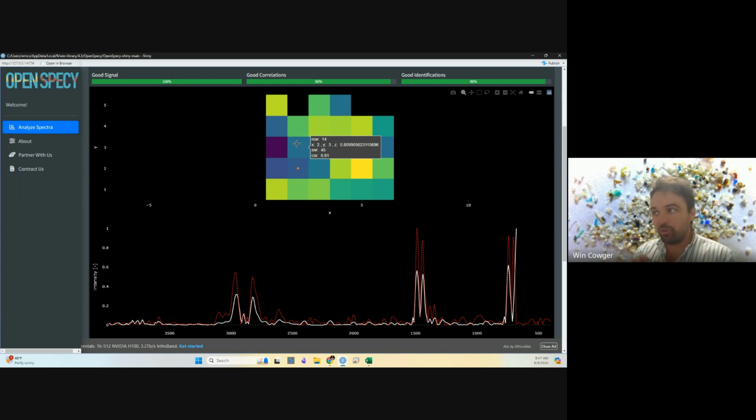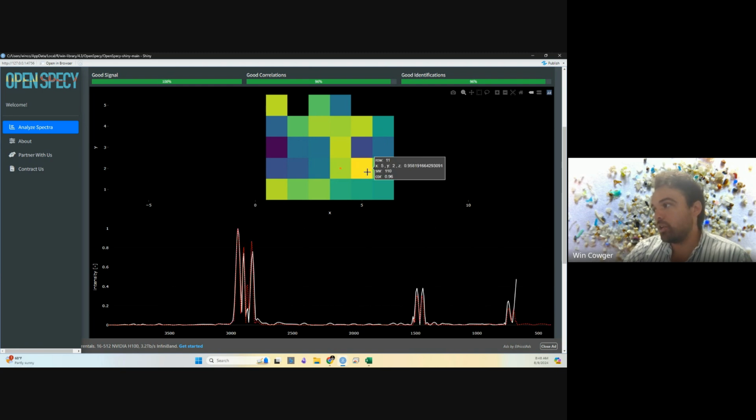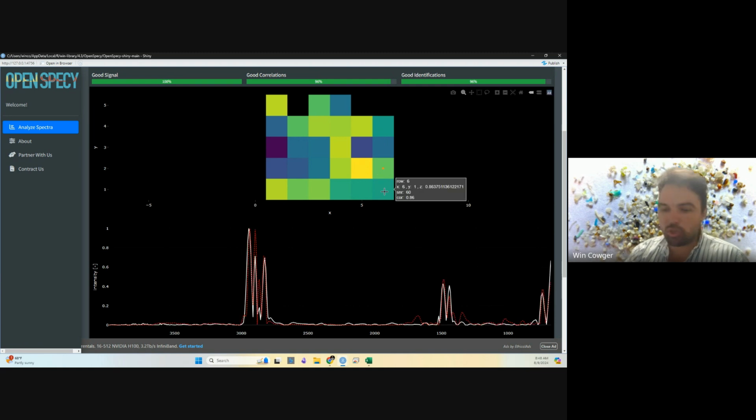You do need to have that level of intuition and not just trust that this is working 100% for you. Because if you trust it 100%, you're giving away a lot of your ability to make very accurate decisions about the spectra. So you definitely want to develop an eye for analyzing the spectra and assessing the matches. Especially if you're just getting into the analysis, I'd recommend starting with single spectrum analysis and spending a few days working through it and understanding how spectra get processed.